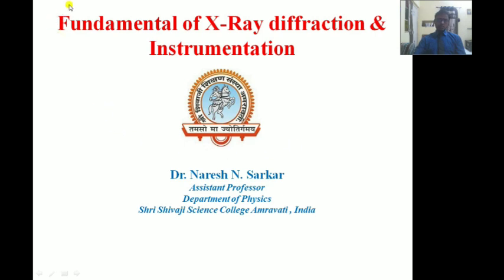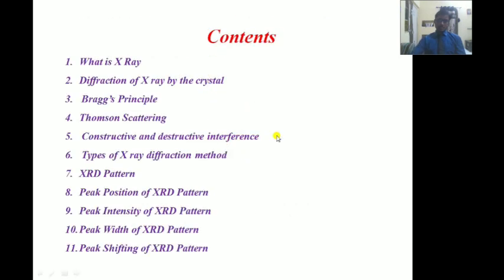Today I am going to discuss the topic Fundamentals of X-ray diffraction and instrumentation. Friends, this lecture depends totally on X-rays, their diffraction and how they are scattered. There are so many fundamental things I would like to discuss throughout this lecture. So these are the contents I am going to explain.